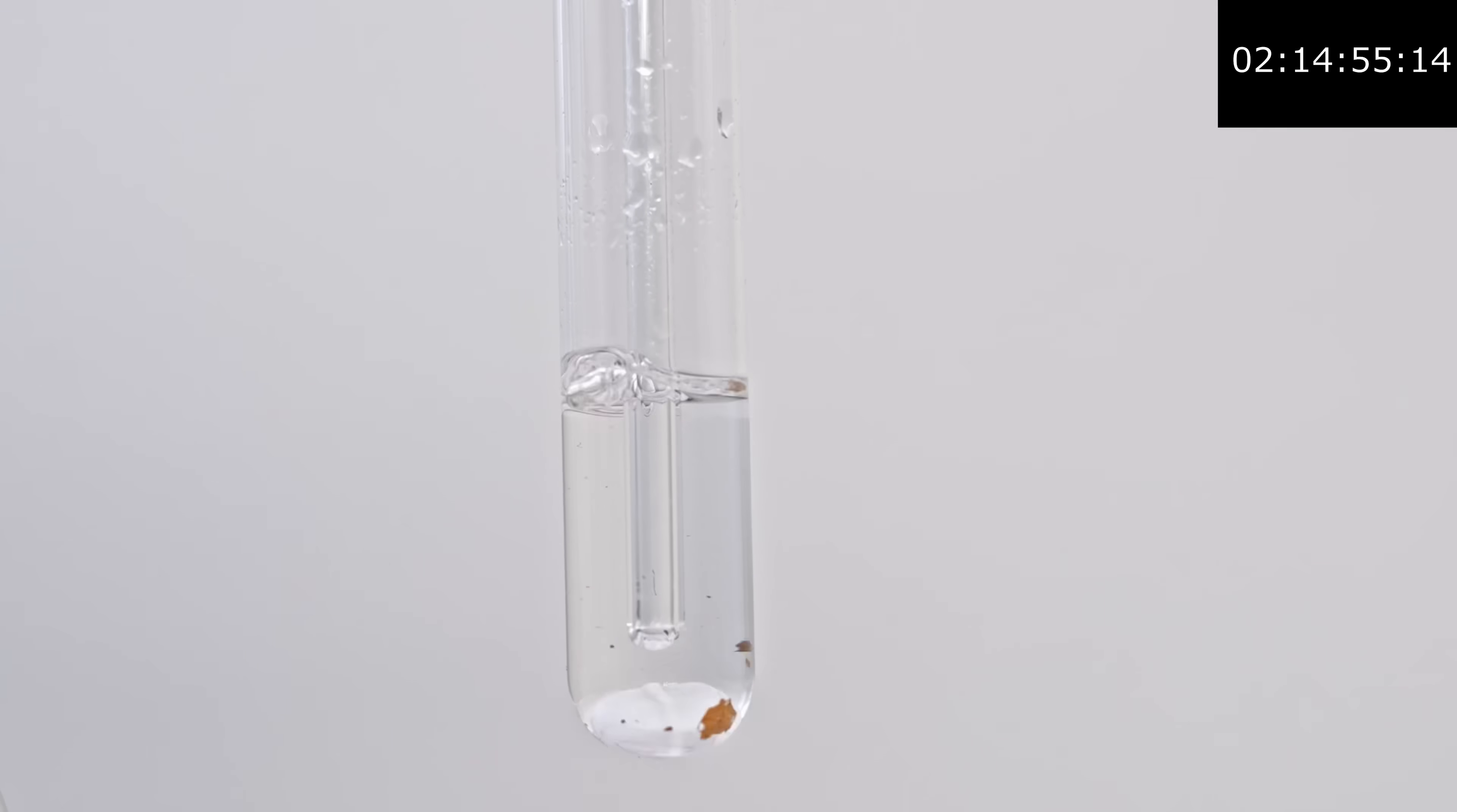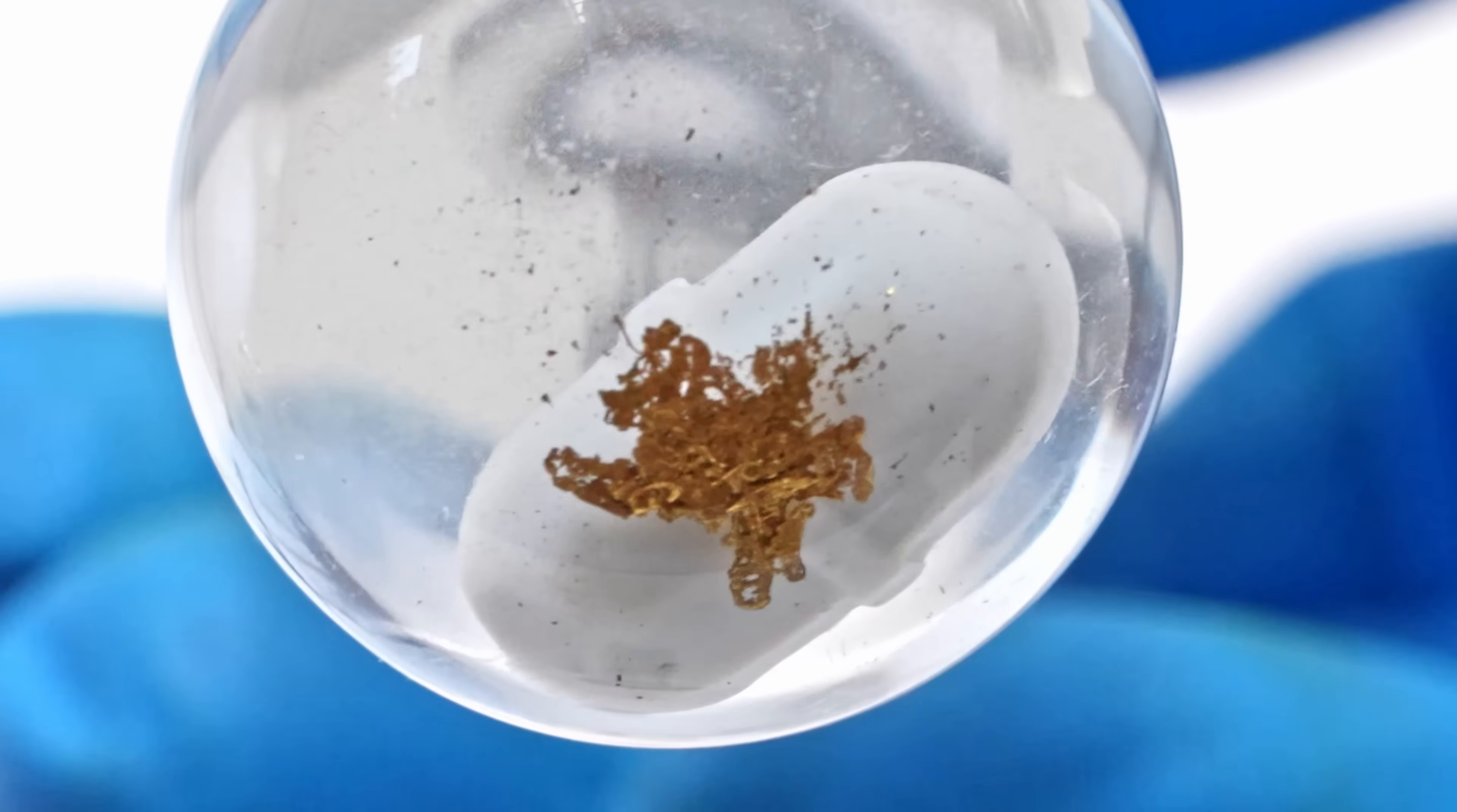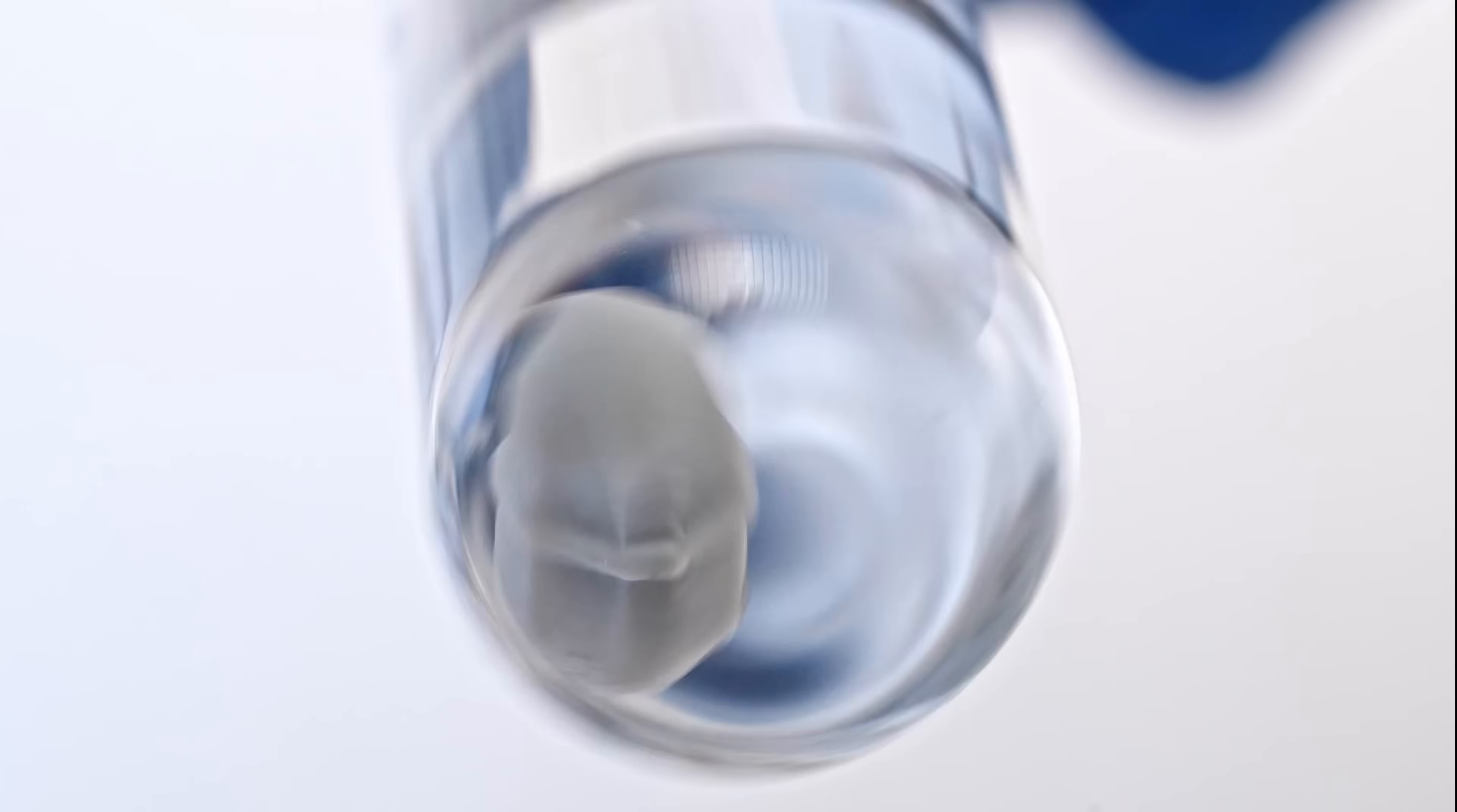However, then the ingot stopped dissolving so quickly, and I had to dissolve it for more than 10 hours, and even heat the solution a couple of times. In the end, I managed to dissolve the gold ingot using a 2% solution of potassium cyanide two times and heating.